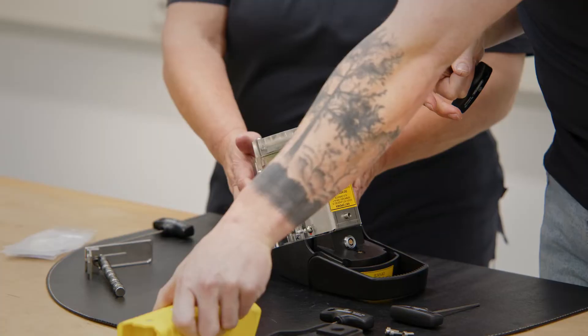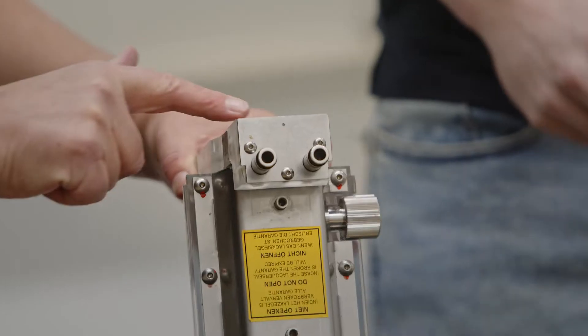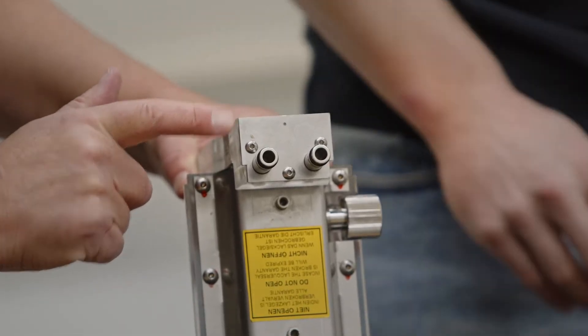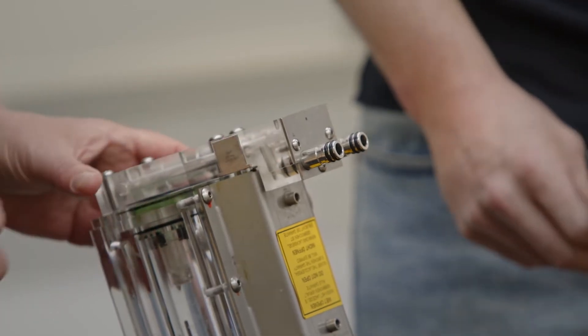Then we have access to dismantle also the back plate — the metal plate — for changing the o-rings that are inside.